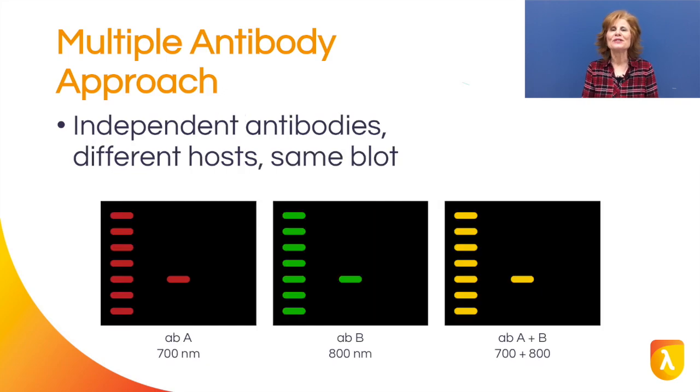Independent antibodies derived from different hosts can be tested on the same blot using multiplex fluorescent detection with different antibodies of different spectral fluorescence. Co-localization of bands of the correct size in both channels is proof of specificity.